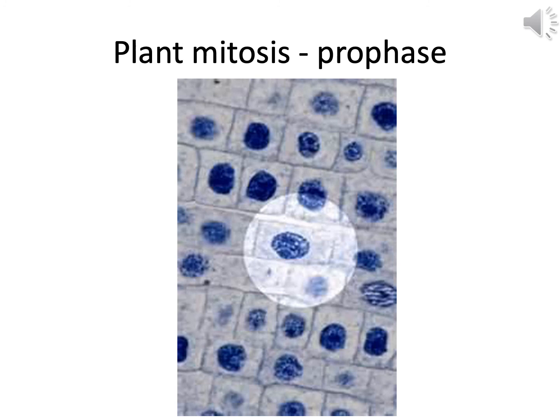The highlighted cell is a plant cell in prophase. They are kind of rectangular cells there, so it is plant cells. And like I said, if you see a blob in the center, that's probably just going to be prophase. Honestly, most of the cells on this slide are probably prophase as well. Maybe a couple of interphases, but most of them I would call prophase.